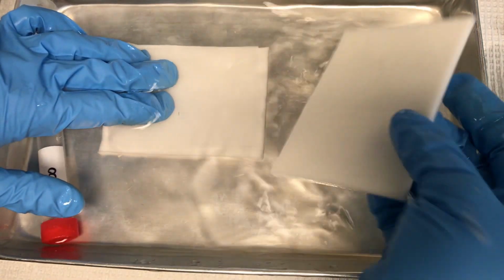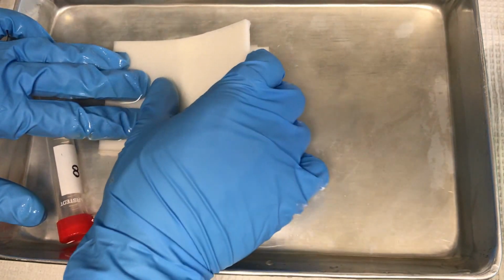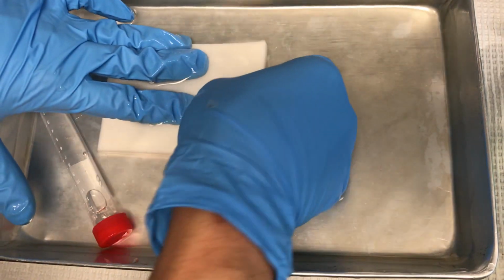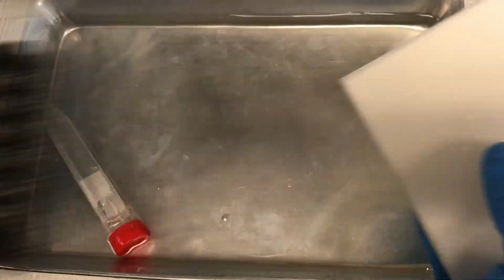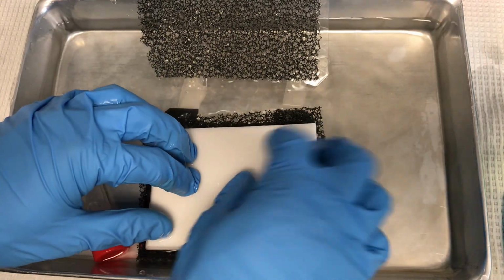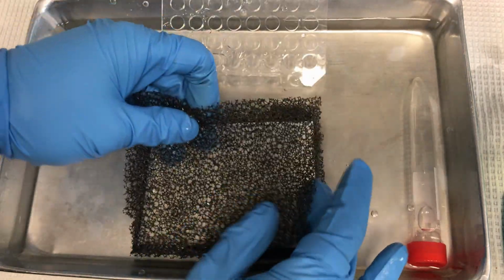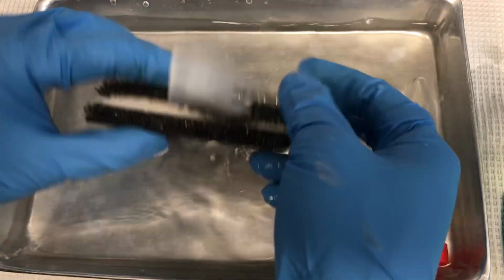After removing air bubbles, lay the filter pad on top of the membrane and finish the construction of the sandwich. Roll it out one last time before taking it out, and add the fiber pad. Roll it out one last time. Then, clamp the cassette together and slide the top hinge to close.